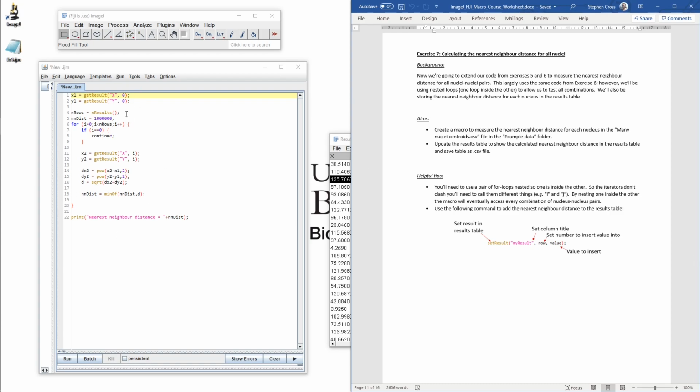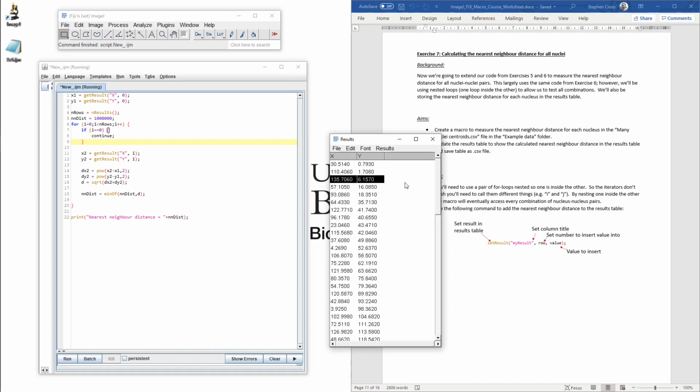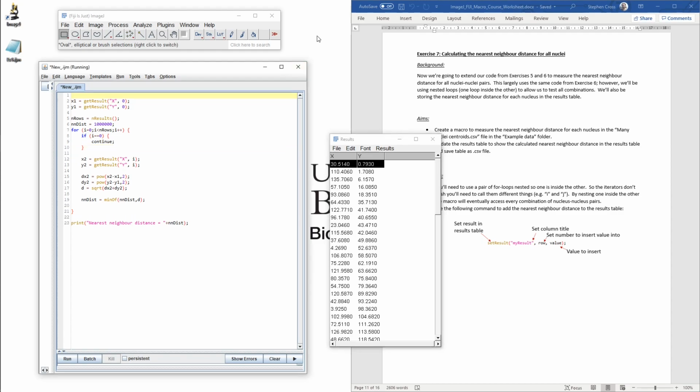We're going to start with the same code as last time, which if we just run again, yeah, that's still good, unsurprisingly. Now, rather than always hard-coded pulling out the 0 row here, what you want to be able to do is put this within an additional loop that 0 value increments each time. So this is your nested loop.